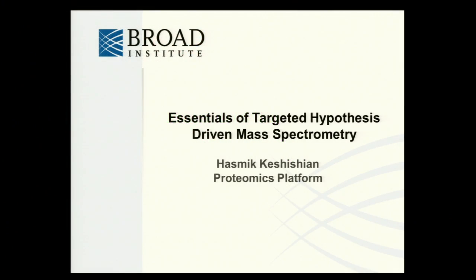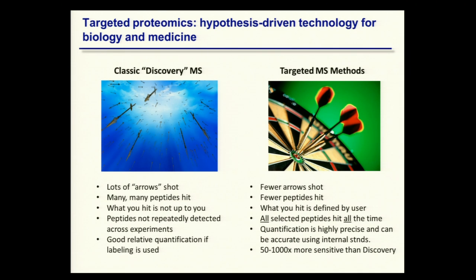Let's switch gears and talk about targeted proteomics. I'd like to basically just introduce the basic concepts and essentials about targeted proteomics today. So far, what you've heard was about discovery proteomics, where we are trying to sequence as many peptides as we can. We're shooting many, many arrows in our sample.